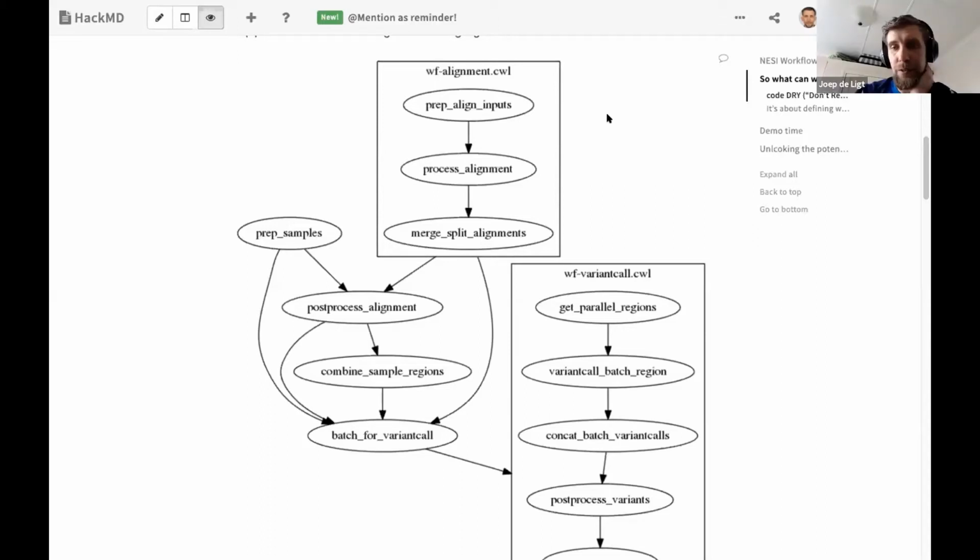Yeah, no, very good question. So this, of course, depends on how robust you want it to be. Most tools these days come with what they call a minimal test set, and that's just really to test if it's doing what it's supposed to be doing. So it's good practice to include a minimal piece of representative data that you can use to run quickly through your code and see if it's doing what it's supposed to be doing.